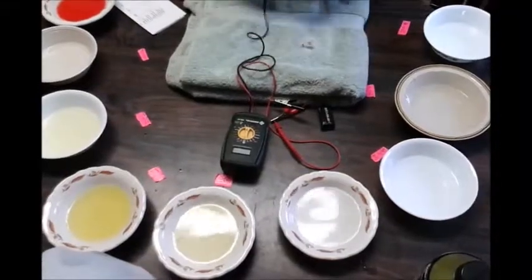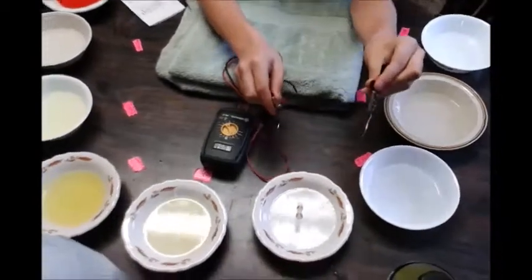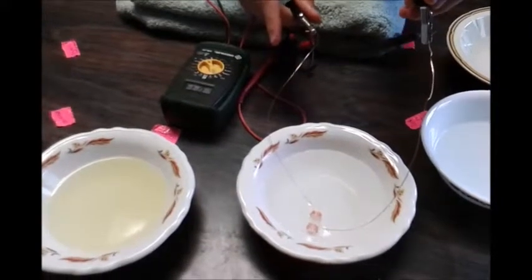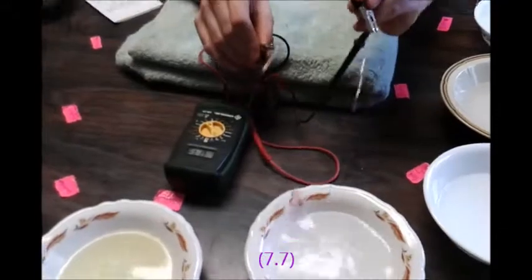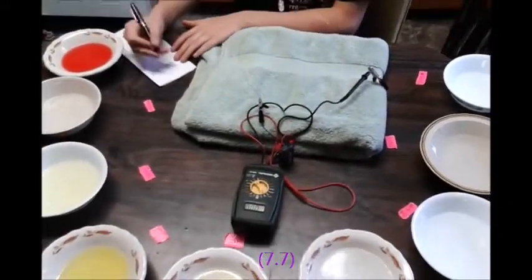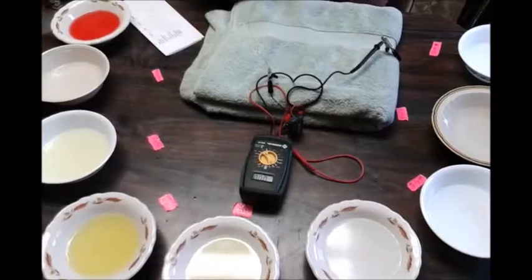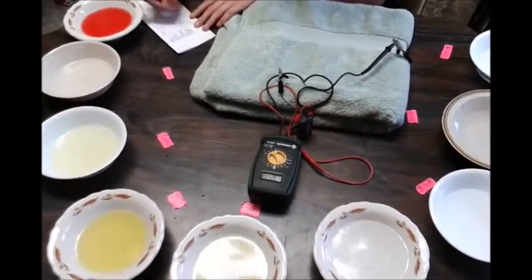First I'll be testing the distilled water. I stick the sensor in completely submerged and get a reading of 7.7. There's no need to rinse since I'm already working with distilled water.